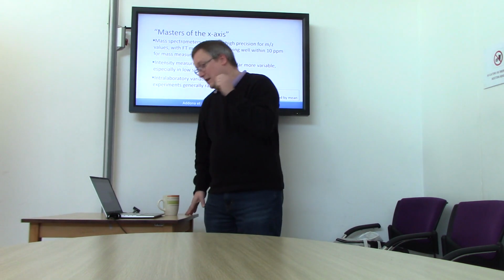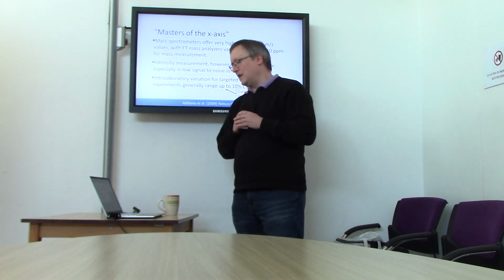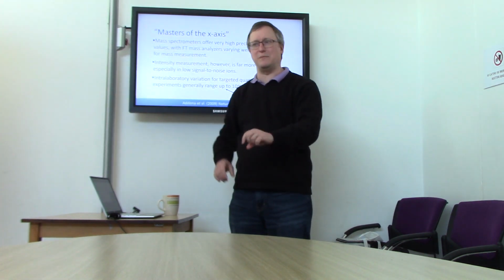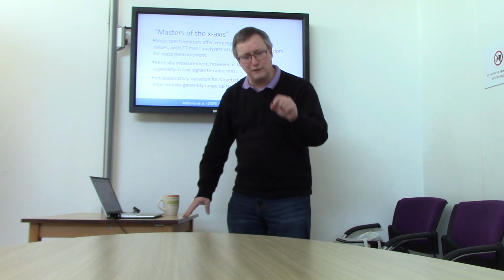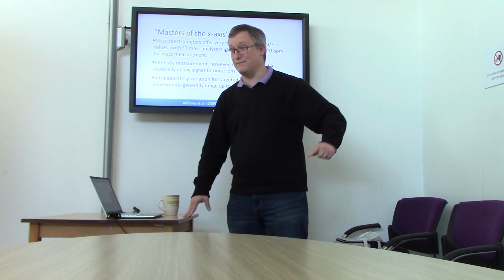However, intensity measurement is always a lot bouncier from a mass spec. When you're looking at ions that are not the dominant one in their mass spectra, but the little minor contributors on the side, if we look at their stability of intensity across their chromatograms, we see an awful lot of jaggedness.